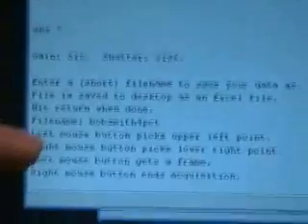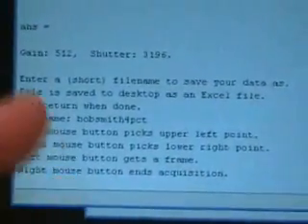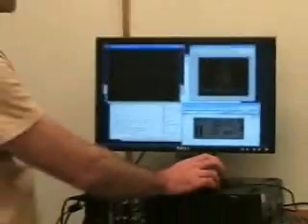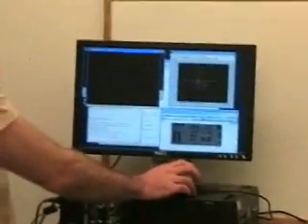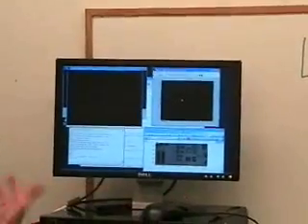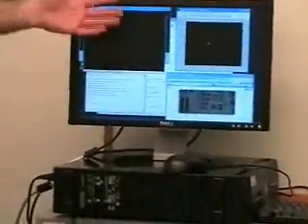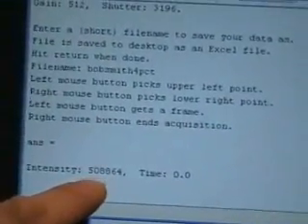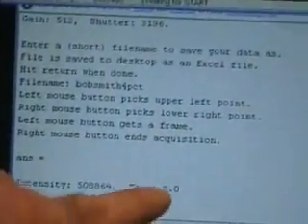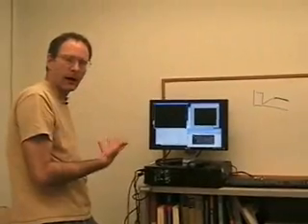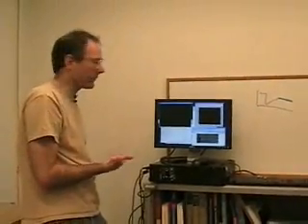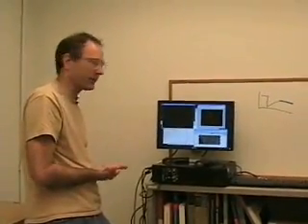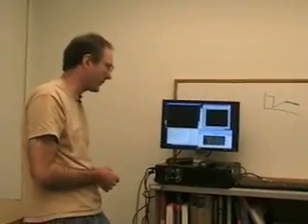It now tells me that the left button will get a new frame and the right mouse button will end data acquisition. So what we can do here, it no longer matters where we move in this frame. If I click, I'll acquire a data point. And right now the shutter's closed, so the data point has nothing in it. But I'll see that I've now got an intensity and a time stamp. In this case, the intensity is 508,000 counts, and the time is zero. The first sample will be zero. And so it's helpful to do a black image first with the laser off because it gives you a sense of what your actual background is. In this case, my background is about 500,000 counts.